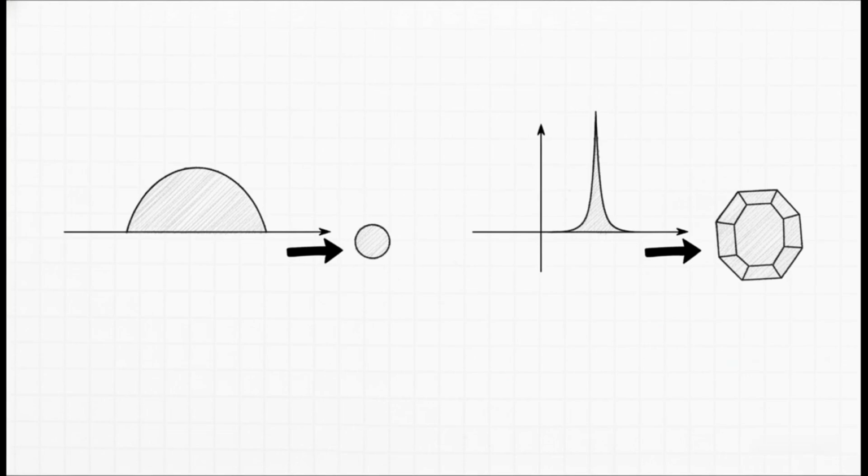But the VIP variable here is beta, the full width at half maximum, which is basically how wide the peak is. Because beta is sitting in the denominator, there's a crucial inverse relationship. As peak broadening goes up, the crystallite size goes down. Simply put, wider peaks mathematically mean smaller crystals.